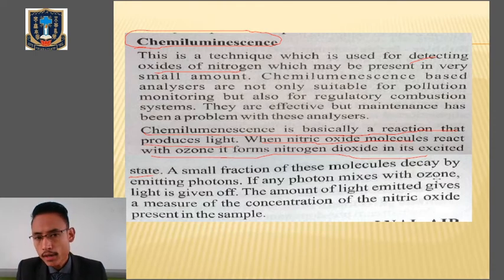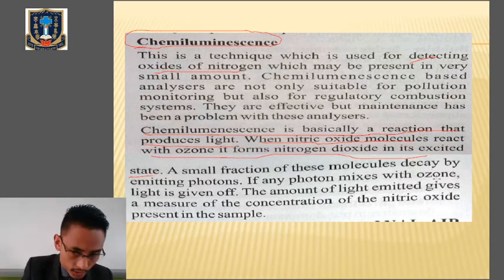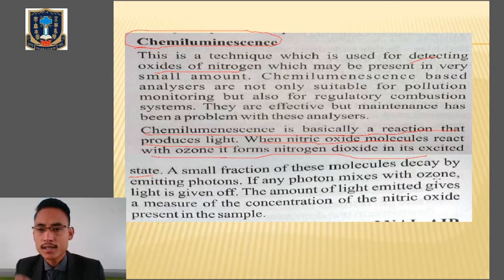So the amount of light being emitted gives us a measurement of the concentration of nitric oxide present in the sample.